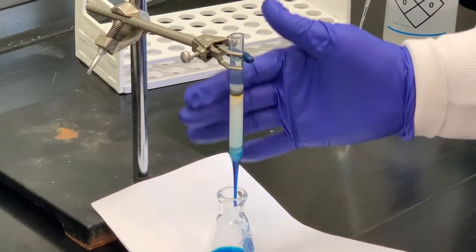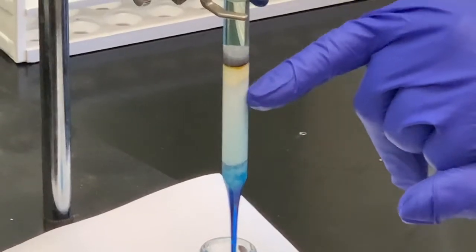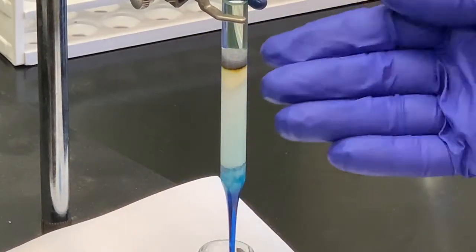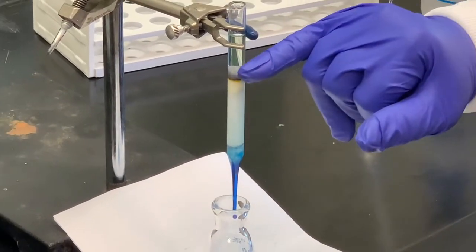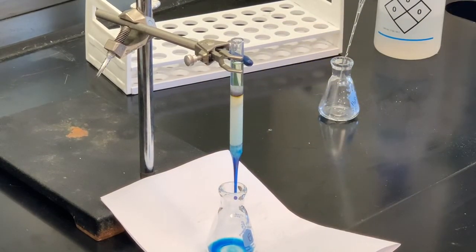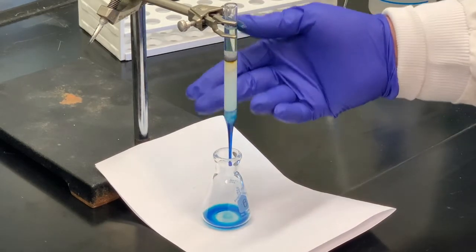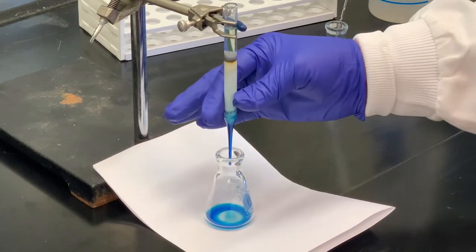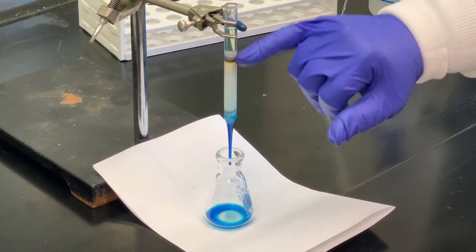Taking another look at the column — you can see that yellow band has gotten larger and is moving down the column. Due to time constraints, we're going to stop the experiment here. To re-emphasize: we started with a mixture of methylene blue and fluorescein, packed the column with alumina, put our sample at the top, and first used only ethanol. The methylene blue had more affinity for the ethanol than for the alumina, which is why it moved down. In an ideal situation, we would have collected all the methylene blue, then switched over to water, and you can see the fluorescein is now starting to move down.